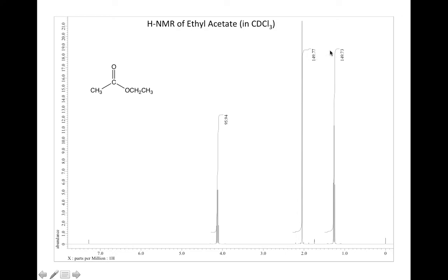And by the way, there's often a 5 to even almost 10% error in the NMR spectra. So if things are not perfectly correct when you do the integration, don't worry too much about that. But these are basically the same. We could round them off to say 150, and maybe rounding off again to about 100 here, you can see that these are about 1.5 times as high. What that means is that there's more protons in these peaks, and if we look at the structure here, since we know what the answer is, there's 2 CH3s, so those would obviously be bigger than the CH2, and in fact they'd be bigger in a 3:2 ratio, in other words 1.5 times bigger. So you can see that these peaks are 1.5 times bigger than that.